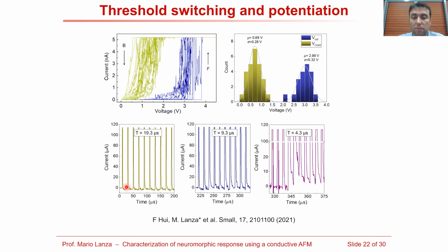In the next step, we try to do the potentiation of this material system using the semiconductor parameter analyzer and the pulse voltage stress tool. When the time between the pulses that we apply is large, we observe that the conductivity increase that we have induced during the pulse can relax.